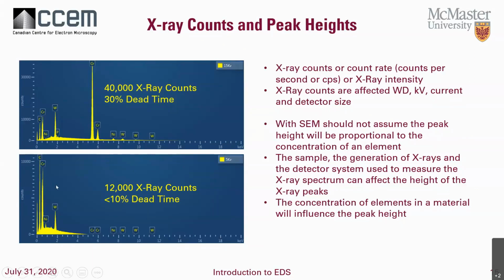So it does have a much taller peak. And so you can't really go by peak height. It is related. The concentration of elements is related to the peak height, but you have to be careful about making conclusions about them.